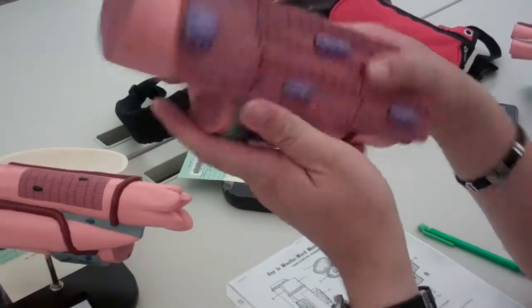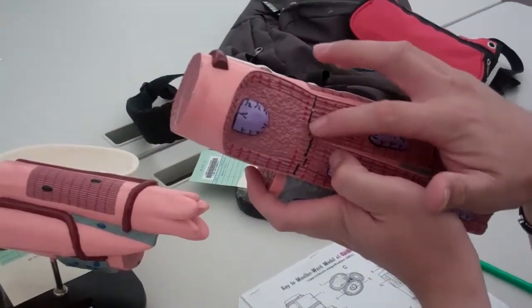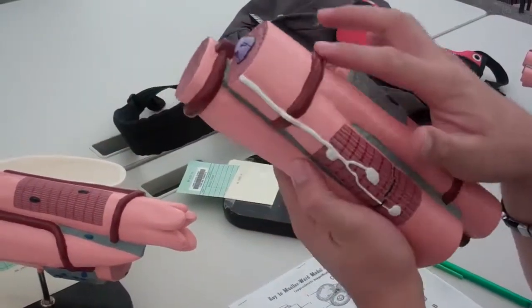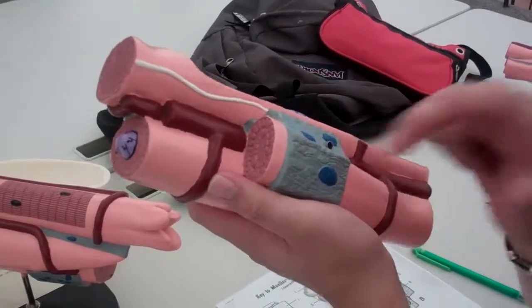So let me go over it again. Sarcolemma, striations are the red lines, intercalated discs are the black lines, nucleus are these, blood vessels are the red blood vessels, the nerves, and then the endomysium, right?